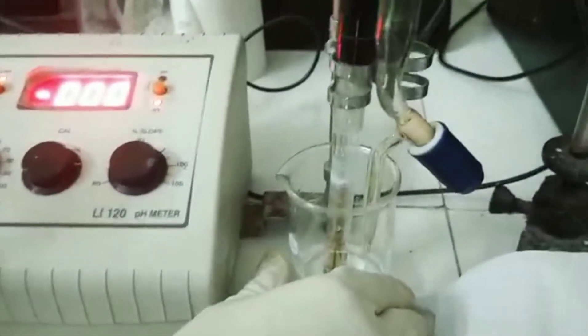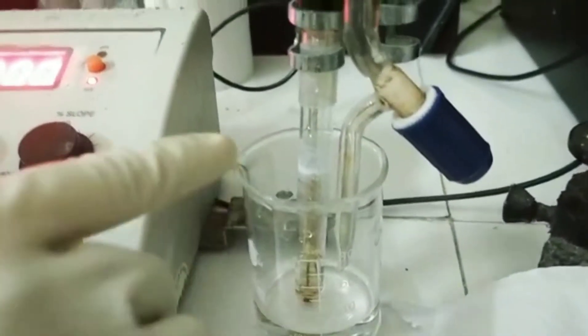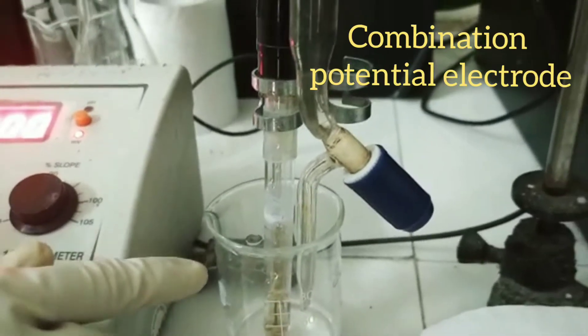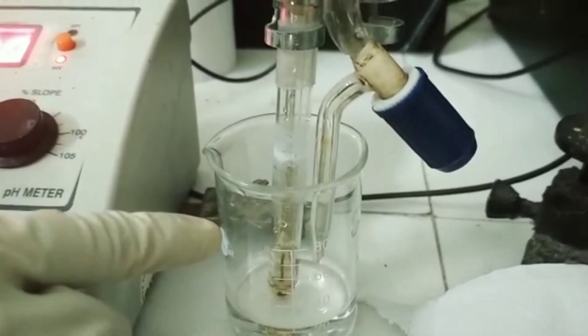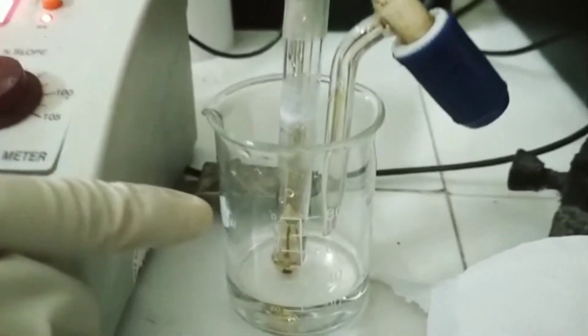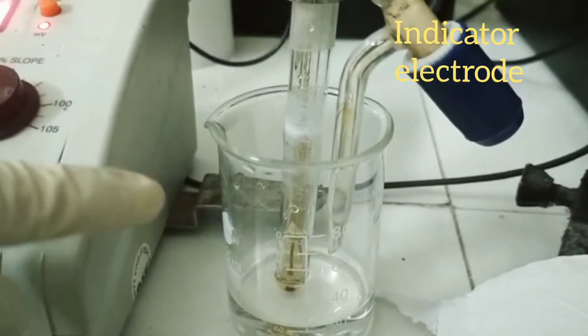And here, the potential is being measured by an electrode here. This is a combination potential electrode. Combination electrode, the name itself indicates it is having two electrodes in it. One is the indicator electrode and the other one is a reference electrode.